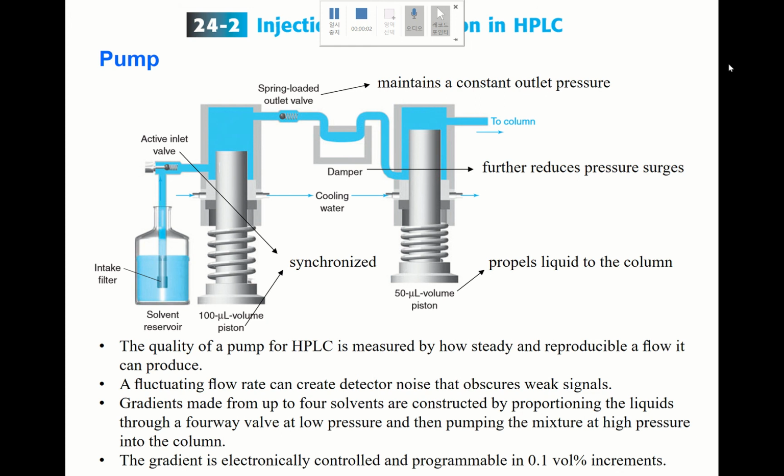Yeah, next topic is injection and detection in HPLC. Okay, let's first consider the HPLC pump. Since sometimes very high pressure is required, the pump is very important. So the quality of a pump for HPLC is measured by how steady and reproducible a flow it can produce.